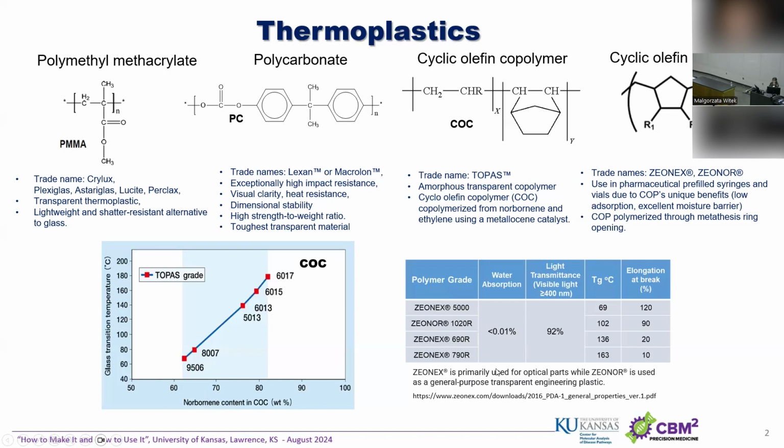And again, you have different grades with different glass transition temperatures that will affect how you use those thermoplastics in your application. So I'm not going to go through all of it. You have all the material. In my presentation, you also have a strong appendix section with additional information that I encourage you to take a look at.